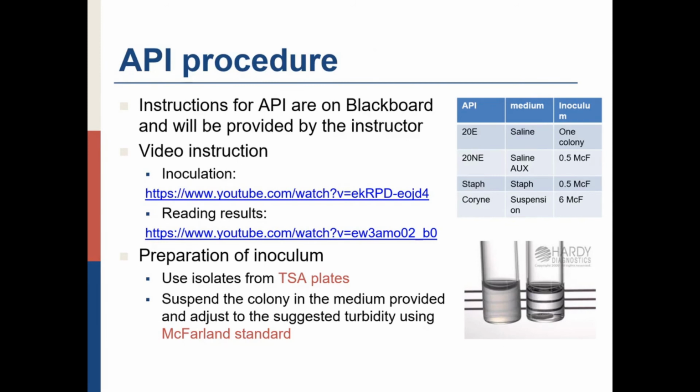Okay, so make sure to watch these videos on inoculation and reading results. They'll be very helpful. Once you've prepared your inoculum, you suspend the colony in the medium and compare that to a standard called the McFarland standard, which is used to test turbidity.